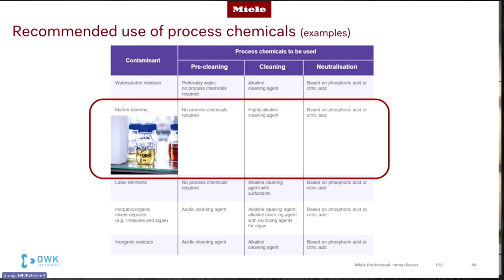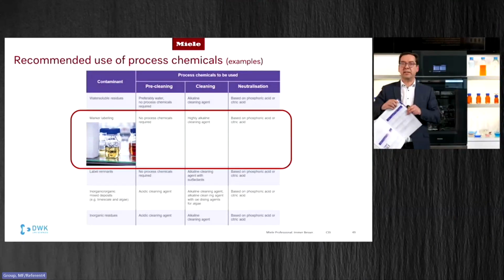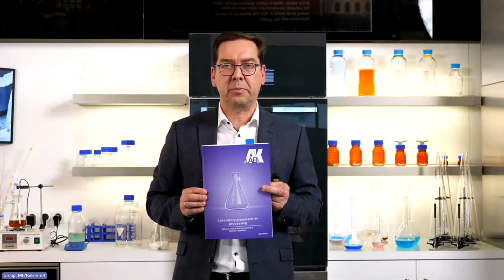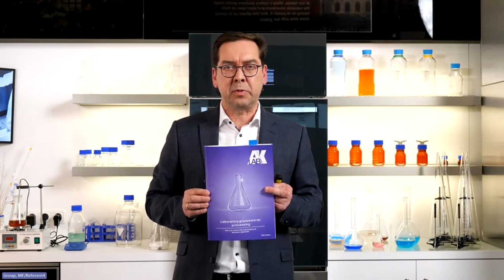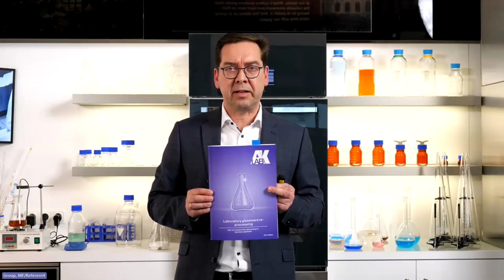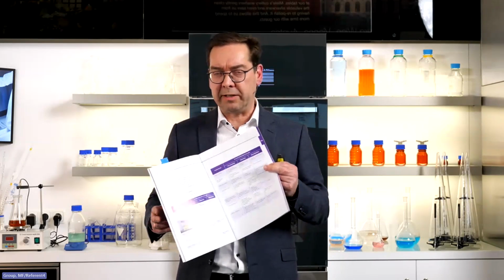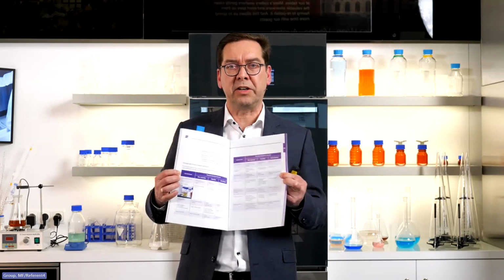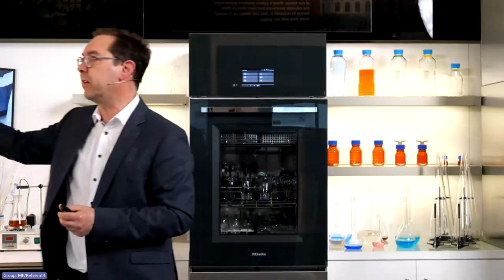And as you can not really read that in a minute, I would just make you aware of this brochure from the AK Lab group. It's an expert group that made recommendations on how to process lab glassware in the right form. And here you also find, on many pages, recommendations on which consumables you should ideally use.